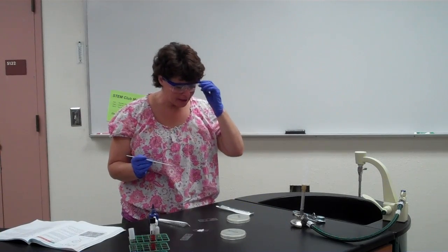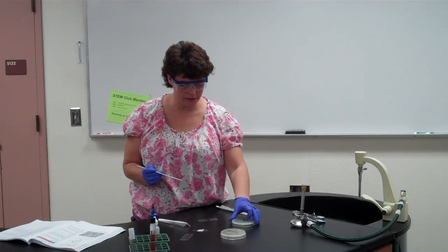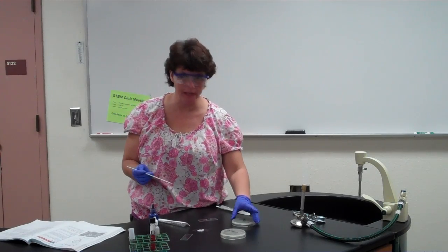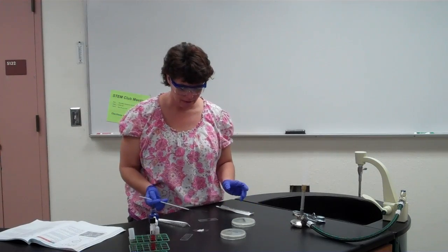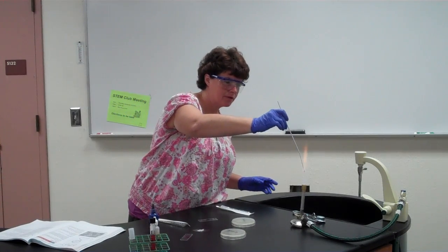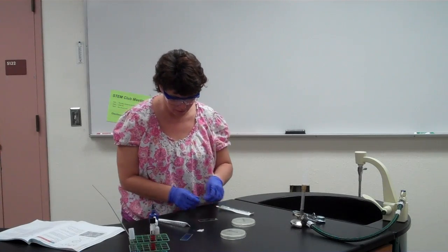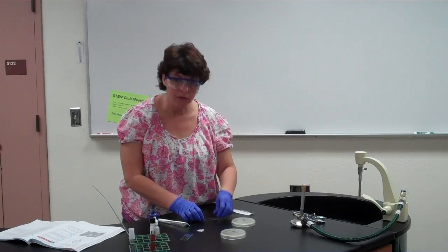Okay, and I'm actually not going to do this because these plates are sterile and I don't want to mess them up. So you're going to take the plate open. So usually we've gone from a tube, but this time we're going to come from a plate. So you're actually going to just open it up, and you're going to take a colony, and you're going to spread it into the blue solution that you have on there already. Okay? Flatten that, get rid of it. And then you're going to cover it with a cover slip. So you're not fixing the slide, you still want it to be a liquid. Okay? So you've just basically added the yeast to the blue solution so that you can give them color.